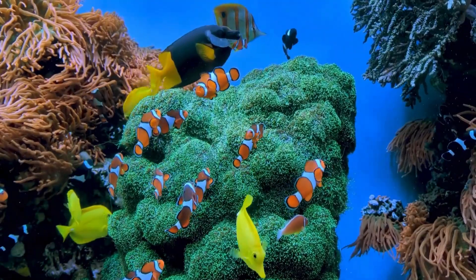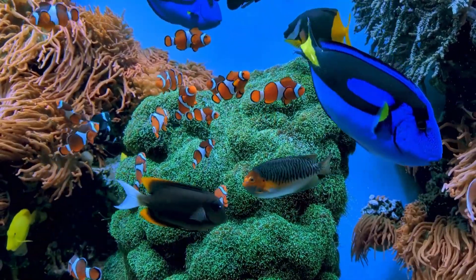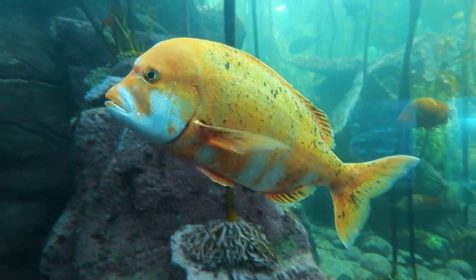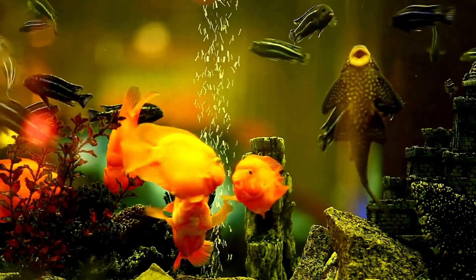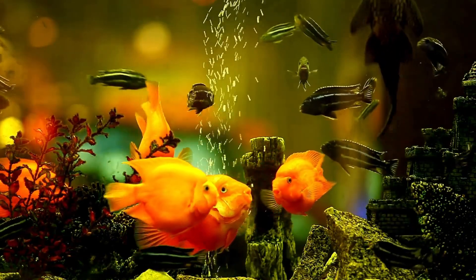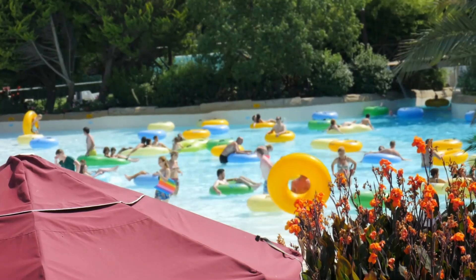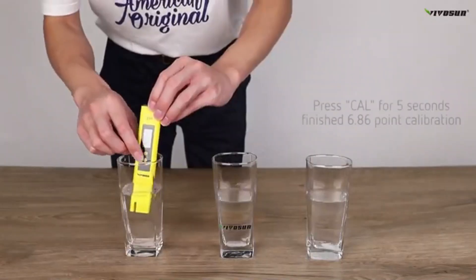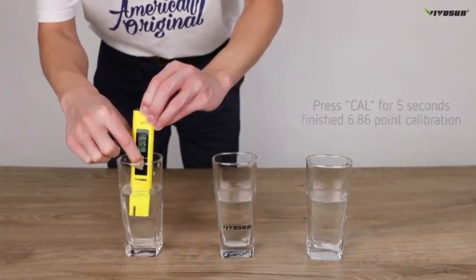For aquarium owners, a stable pH is vital for the health of the fish. Drastic fluctuations can cause stress, diseases, and in extreme cases death. This meter gives you the peace of mind to know that your aquatic friends live in a safe environment. And if you have a swimming pool, an unbalanced pH is not only uncomfortable for swimmers, causing eye and skin irritation, but it also reduces the effectiveness of chlorine, leading to cloudy water and algae.